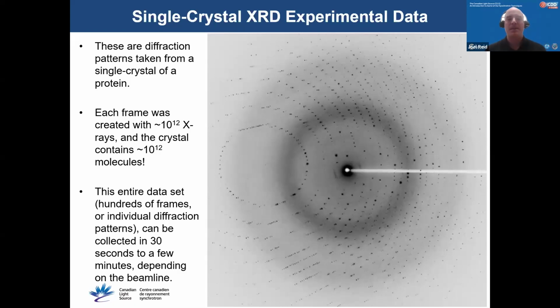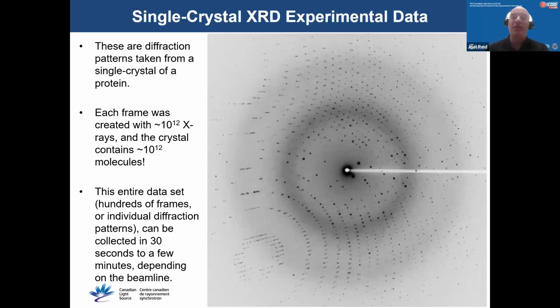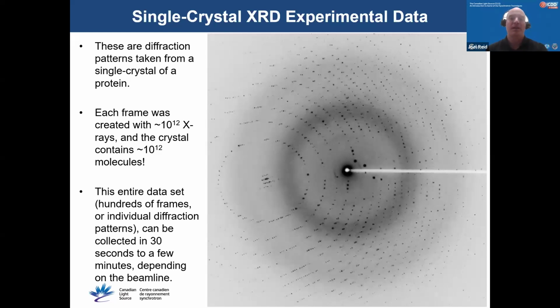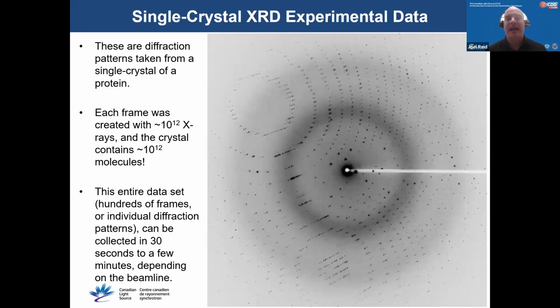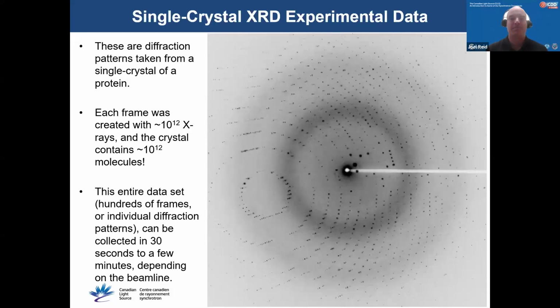You can also operate these beamlines from home. Over 90% of our CMCF users operate the beamlines remotely. The users ship us the samples, we load the samples for their beam time, and the user takes over remotely using a robot to mount the samples.